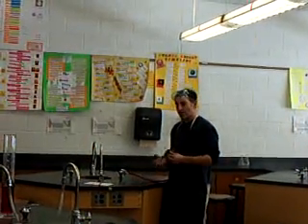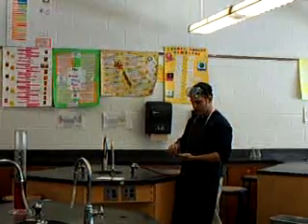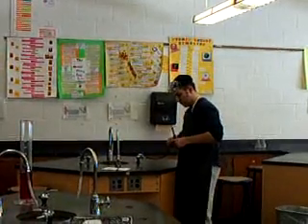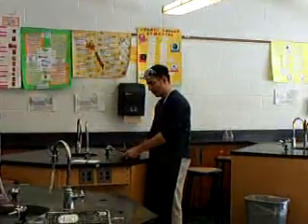The person before you should have closed up your Bunsen burner. Now we want to open it up at the bottom so that we can light it. I'm not going to open it until after I've already connected it. So I'm going to hook it up, open the Bunsen burner, and push it all the way on again.